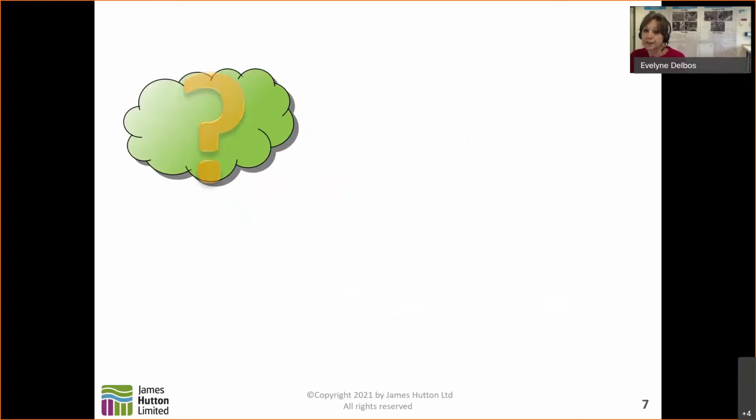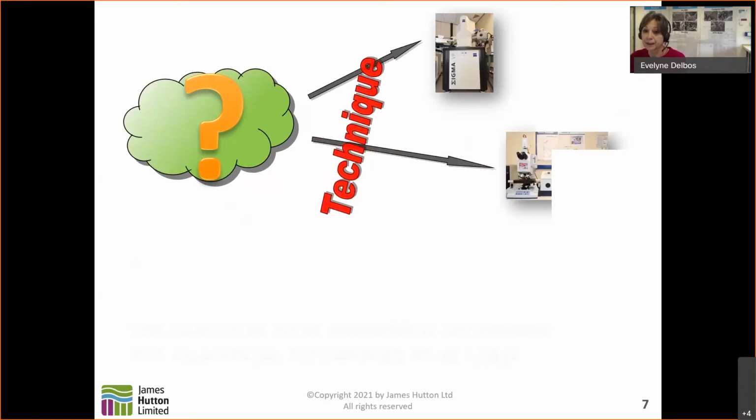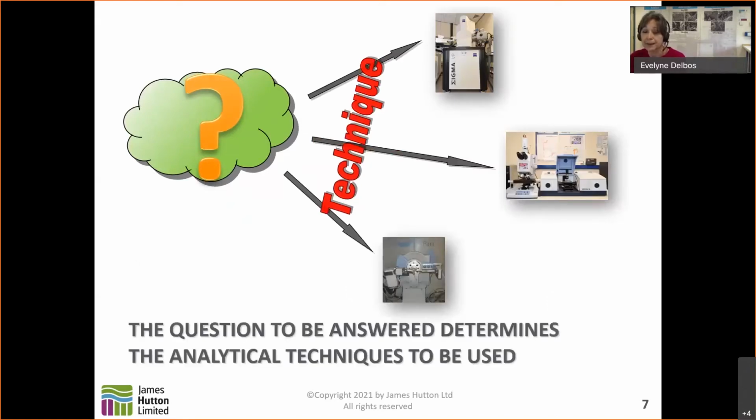So you may have some material of any type that is really causing you some headaches, and the best way to characterize it may be a little bit obscure. So what is very important to remember is that the question you have about these materials will actually define the technique that we will be using to answer your question. So really keep in mind that question. Next slide, please.